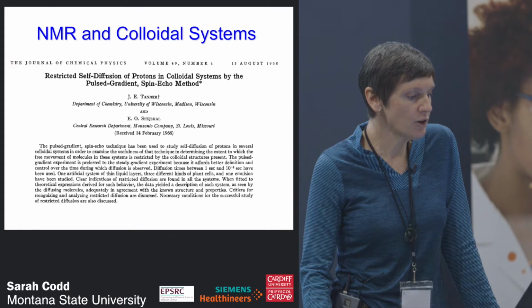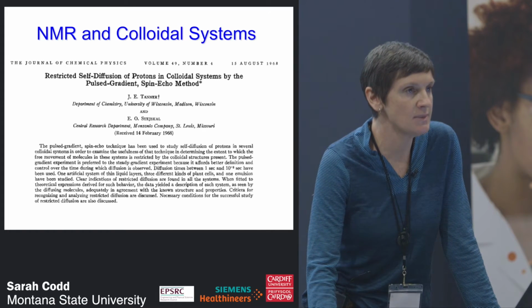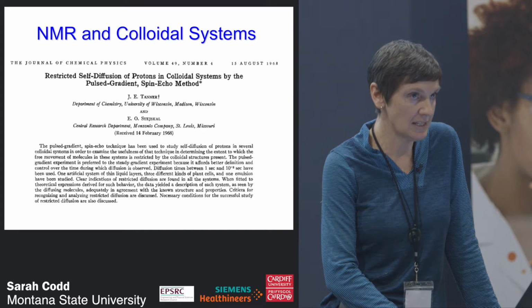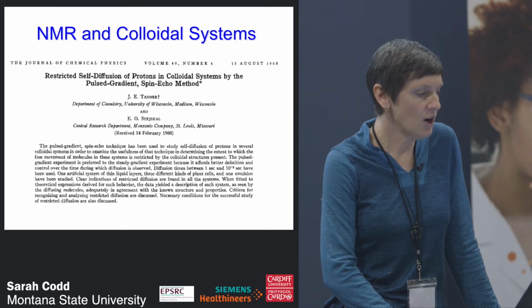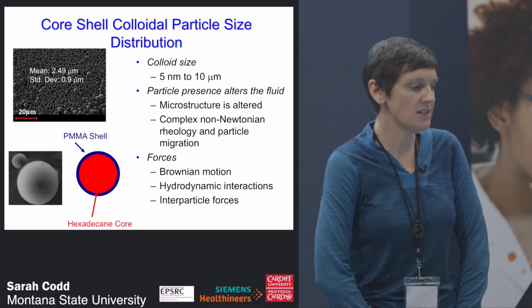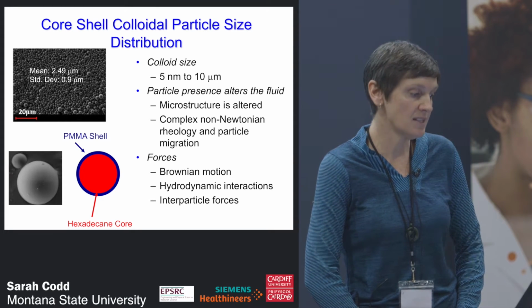In the very early days, we were looking at restricted diffusion inside colloidal systems, looking at the way in which molecules move around those colloidal particles to get access to the restricted diffusion of those systems. So we sent a student over to Sweden to work with Magnus and learn how to make these particles. And we've been using these particles ever since in our lab.